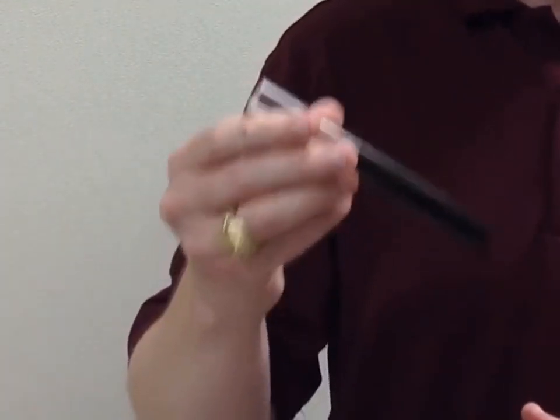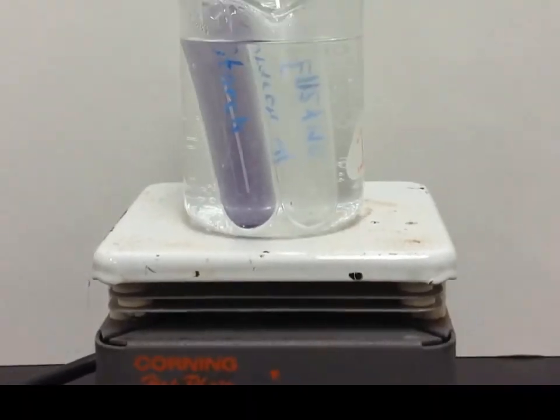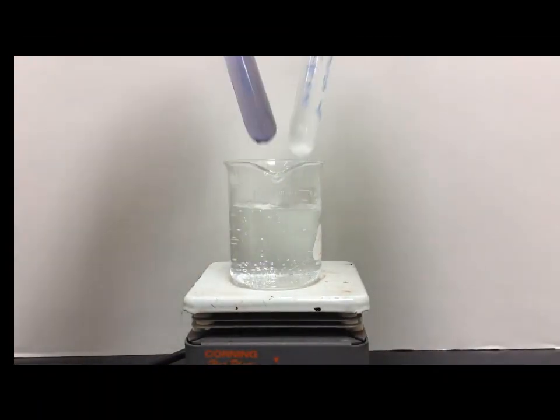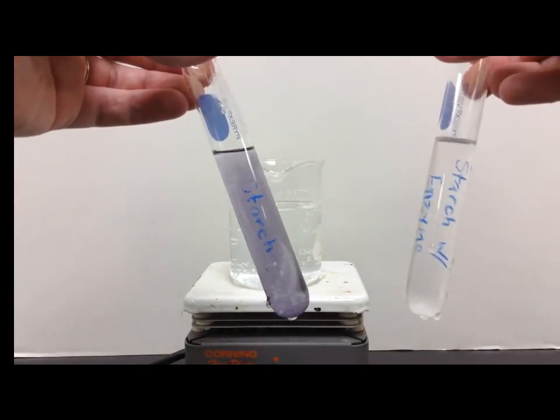Iodine makes the starch solutions black, but once the starch has been digested by the enzymes, that black color will go away. You can see here that after our enzyme was allowed to work, that's exactly what happened, and the color in that test tube went away.